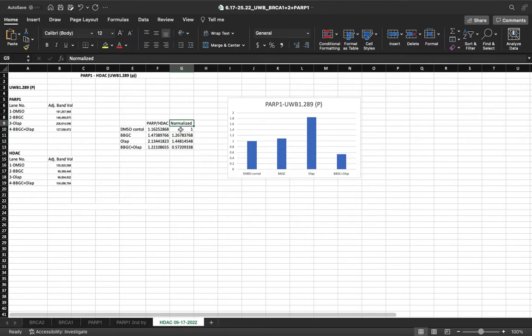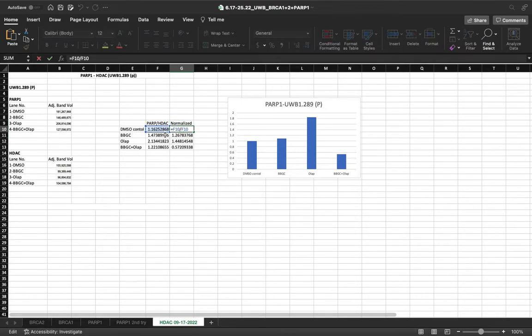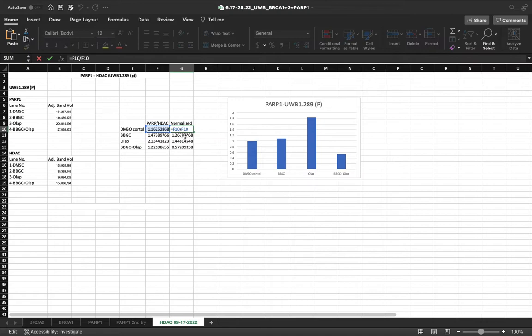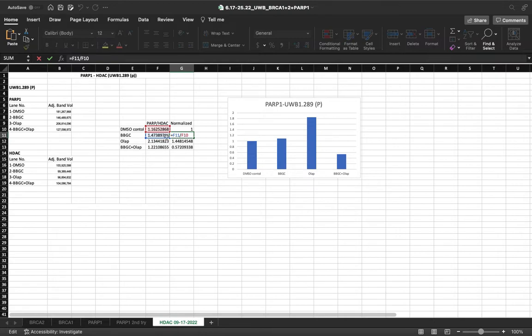So, the first one, the DMSO control, should equal 1 because it's the 1.16 divided by itself. The second will be the BBGC over the DMSO control.